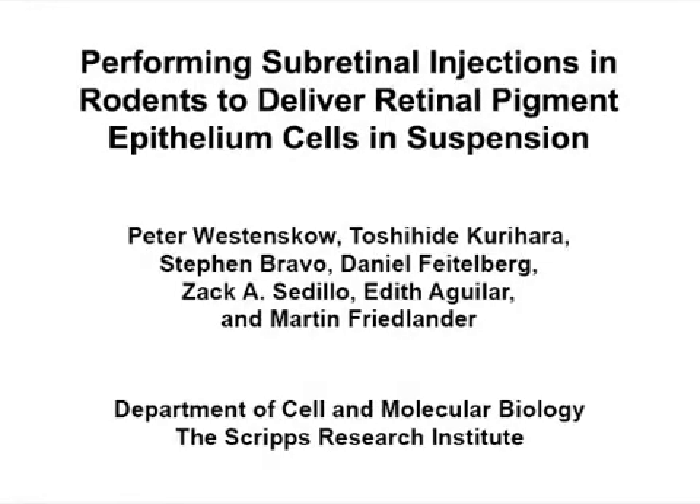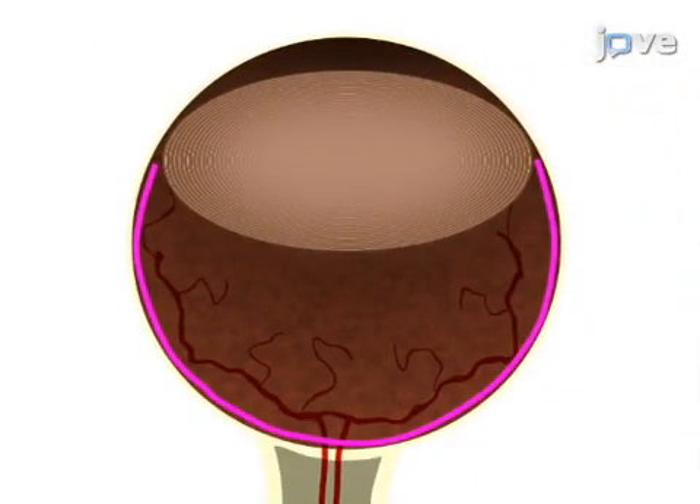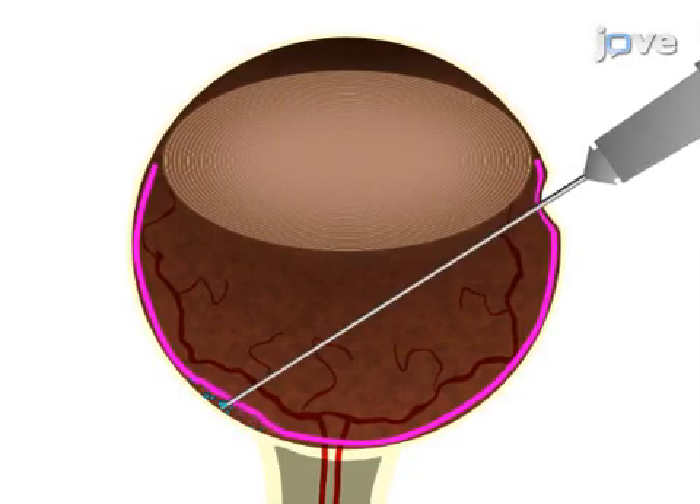The overall goal of this procedure is to inject retinal pigment epithelium, or RPE, cells into the subretinal space of rodents while minimizing trauma. This is accomplished by first using a sharp needle to poke a hole in the eye of a sedated animal. Next, the cells are injected into the subretinal space using a blunt needle.